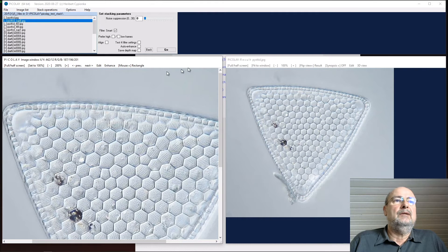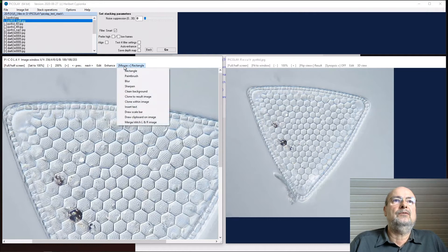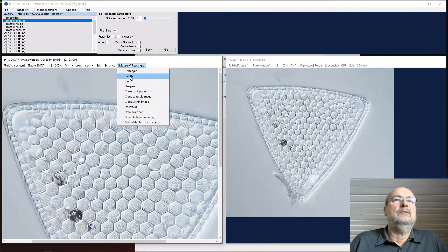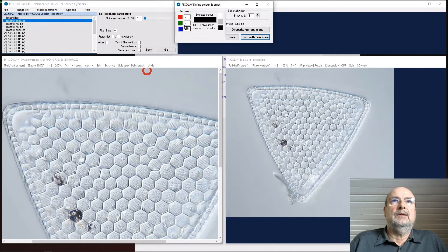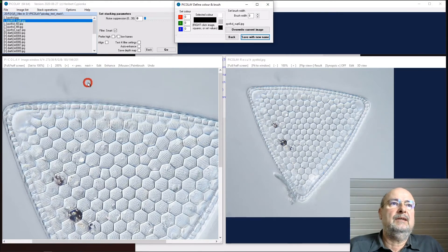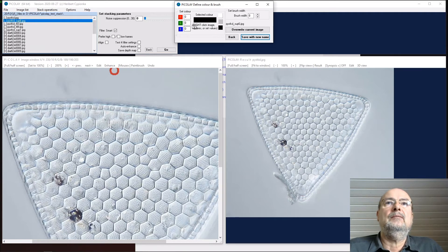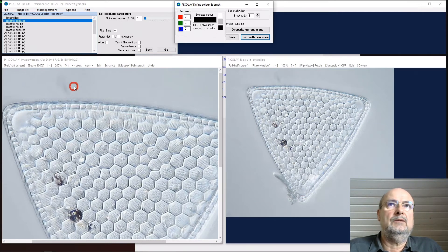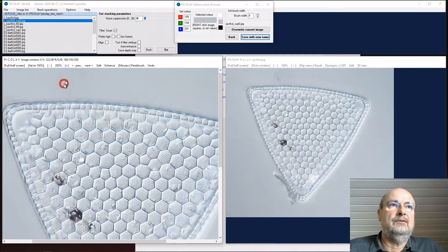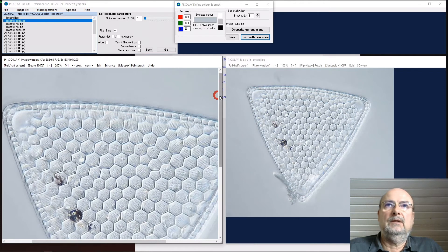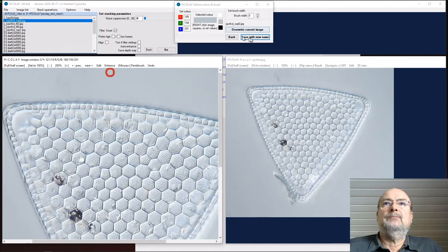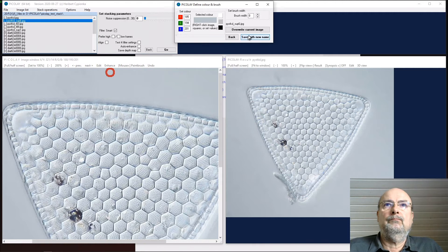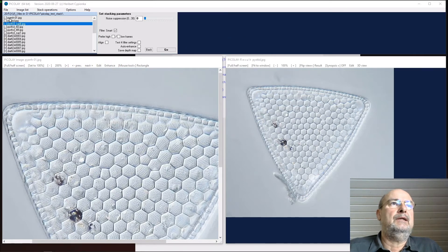The mouse can be changed to be a paintbrush, and you get a new panel here. You can select the color and the width. The simple thing is you click with the right mouse button into a color you would like to take for drawing, and then you go over this dark area and you can clean it very nicely.